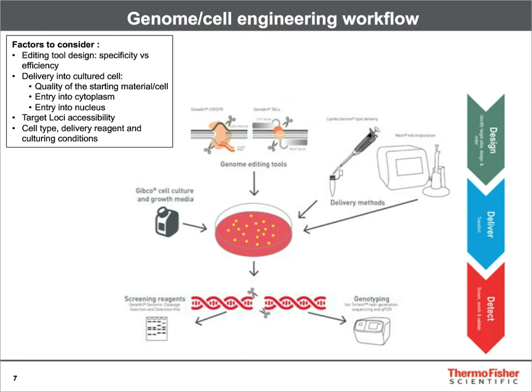If you look at the genome and cell engineering workflow, from designing the genome editing tool to analyzing the cleavage efficiencies of these gene editing tools, there are three main steps: designing a target-specific genome editing tool, delivering it into the cell type of choice, and detecting and analyzing the efficiencies downstream. There are several different factors to consider to successfully edit your cell.